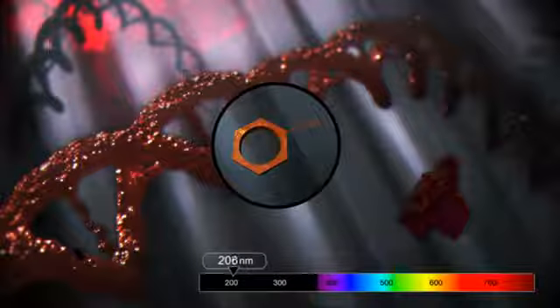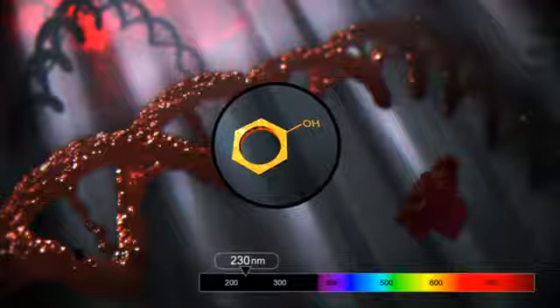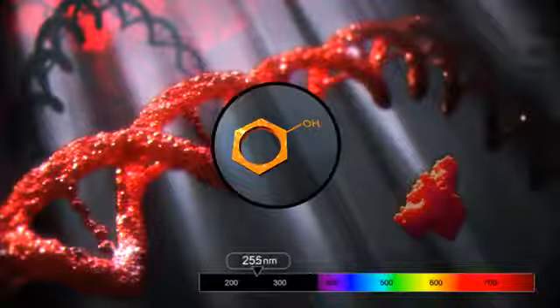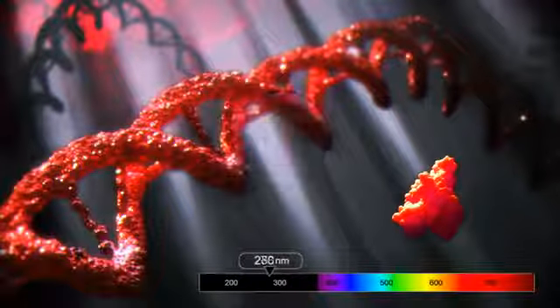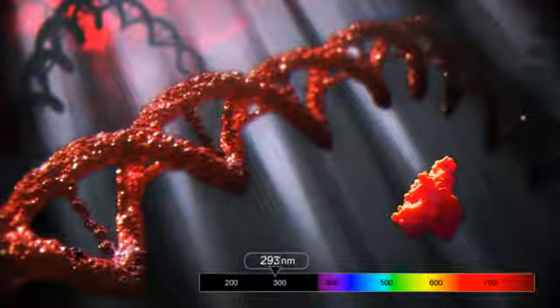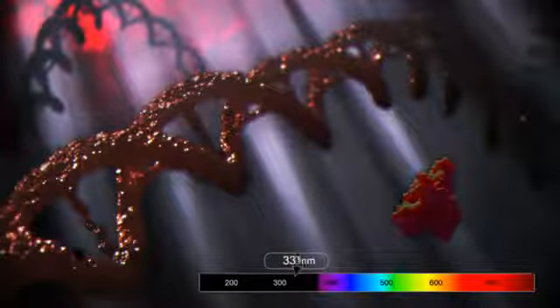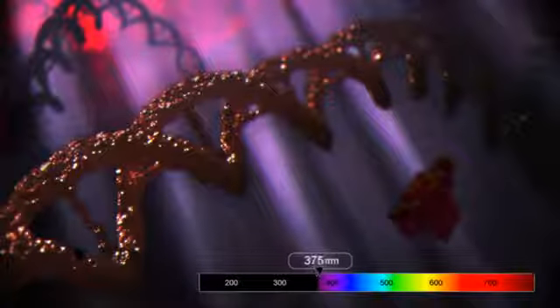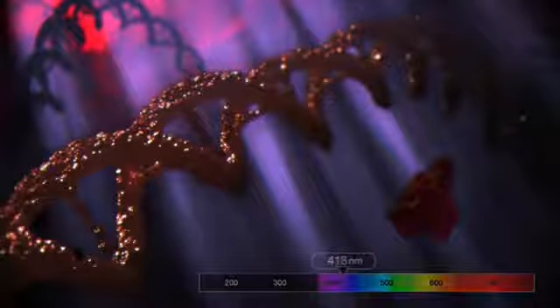The absorption profile provided by the NanoDrop One instrument can be used to detect contaminants, which may impact downstream applications. For example, proteins absorb at 280 nanometers. Therefore, the absorption 260/280 ratio can be used to estimate nucleic acid sample purity. Protein and peptide concentrations can also be obtained by measuring absorbance at 205 nanometers. For example, phenol, which is used to extract nucleic acids.